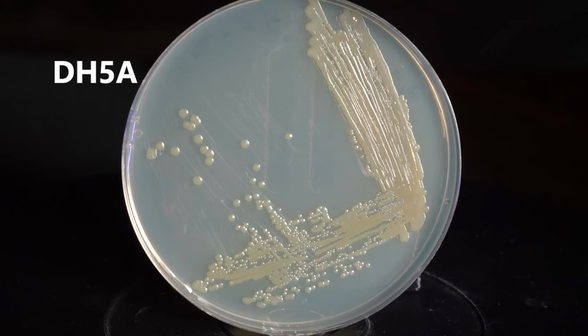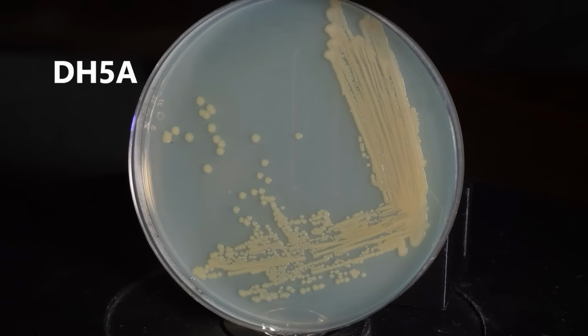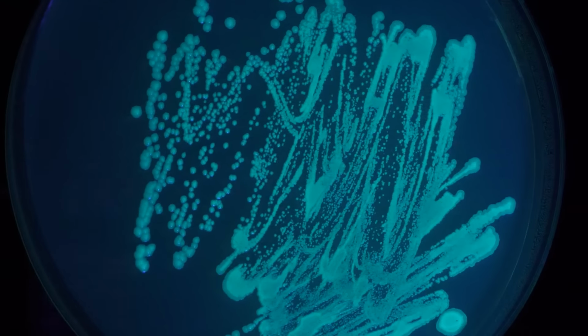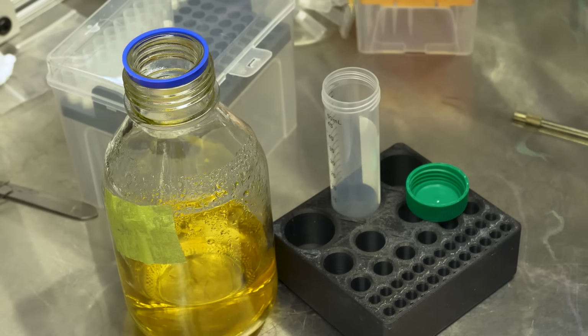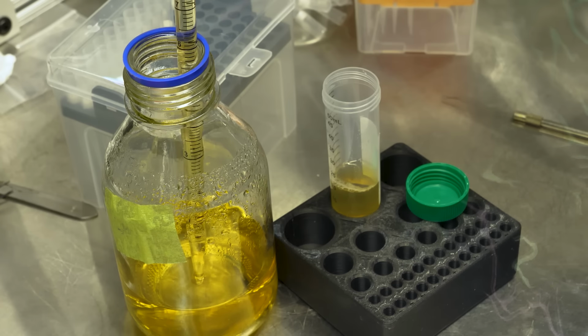It is a super common lab strain that both grows quickly and is easy to put DNA into, though it's not the best for protein production. For our purposes today, that's fine, and the ease of transformation is what we want, and you can get it now on our store. To get started, we need the bacteria to be very actively growing, so I'm going to set up a liquid culture to grow overnight.